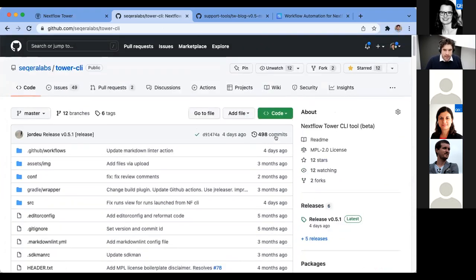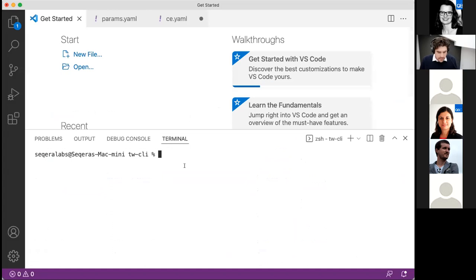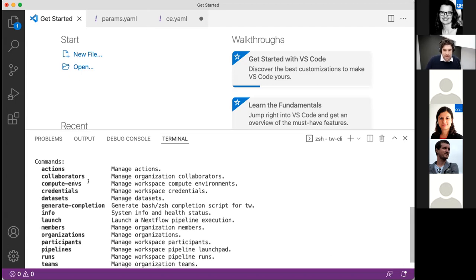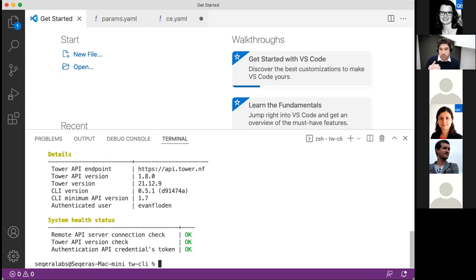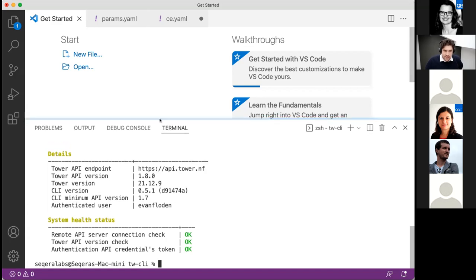I'm now going to switch over to my terminal and run a little bit from there. The command we call is 'tw' — and you can see all the different commands available. Tower can interact with all the different aspects of the system: actions for automations, collaborators, compute environments, credentials, datasets. You can also run 'tw info', which is a health check — it connects to the Tower instance, checks connectivity, shows the version, and confirms which user is authenticated.